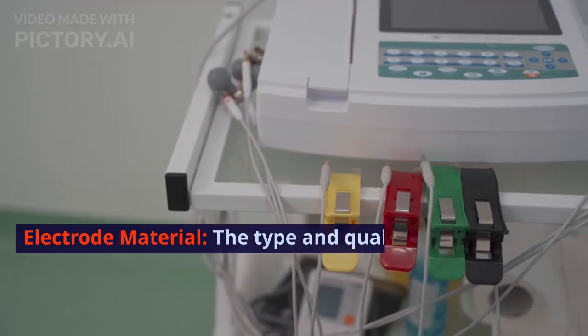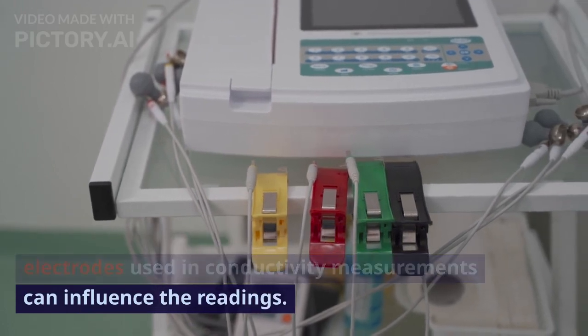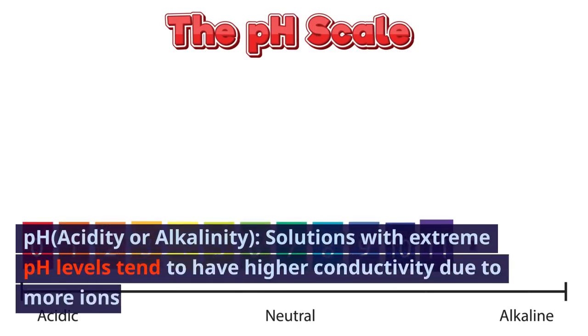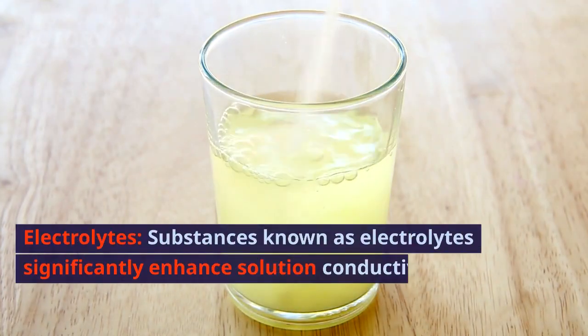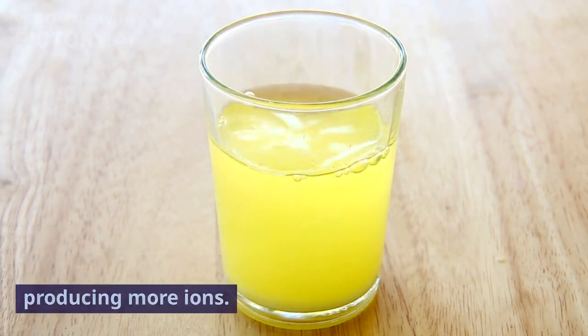Electrode material. The type and quality of electrodes used in conductivity measurements can influence the readings. pH, acidity or alkalinity. Solutions with extreme pH levels tend to have higher conductivity due to more ions. Electrolytes. Substances known as electrolytes significantly enhance solution conductivity by producing more ions.